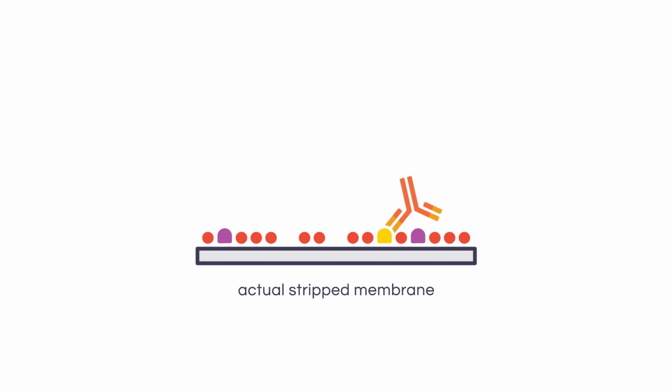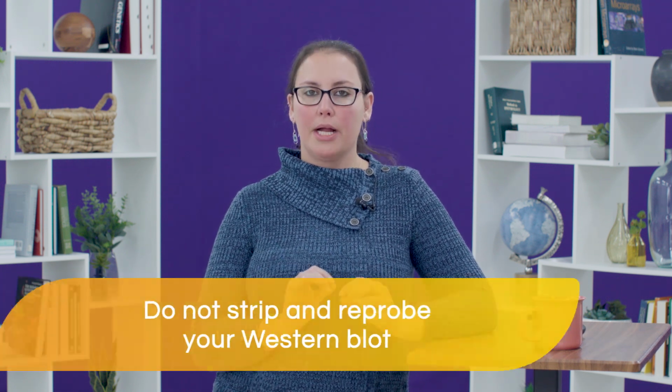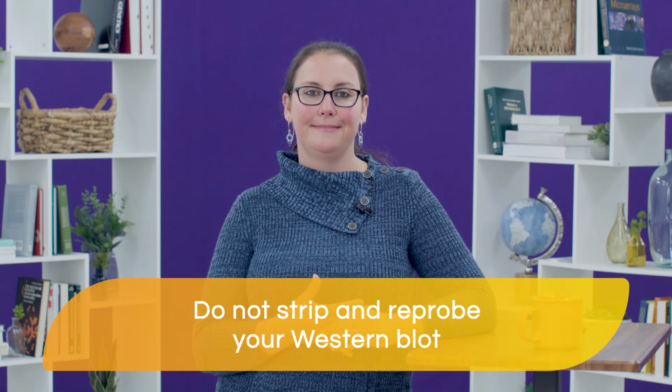On the other hand, that primary antibody remaining on the membrane may also compete with the second primary that you incubate on that membrane. In that situation, you will once again run into underestimating your second target of interest. So that's a lot of variables in there that will compromise data accuracy, and it's very hard to account for all of them. Because of that, we strongly recommend that you do not strip and reprobe your Western blot.